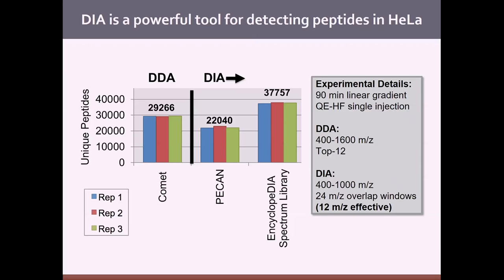And a lot of the things we did pick up that we found that were specific to Pecan, there was very little MS1 signal in them. So that was something that we felt like was potentially a unique capability, the ability that we could find things within a fairly narrow MS isolation window that had very little MS1 signal to start.